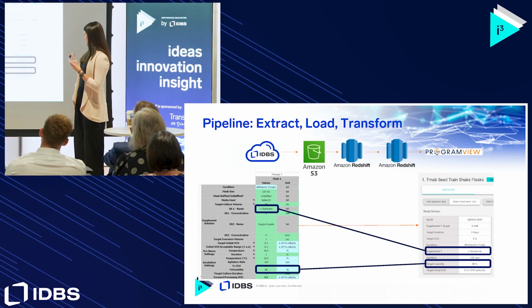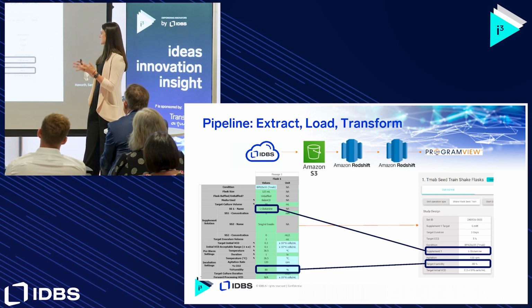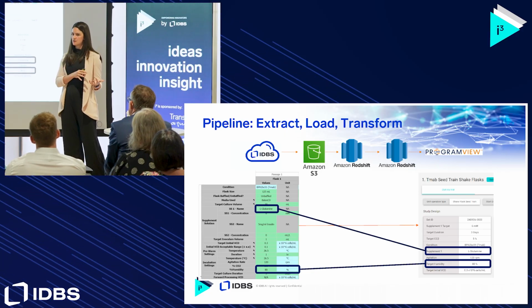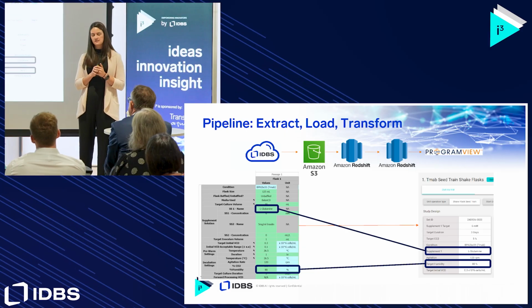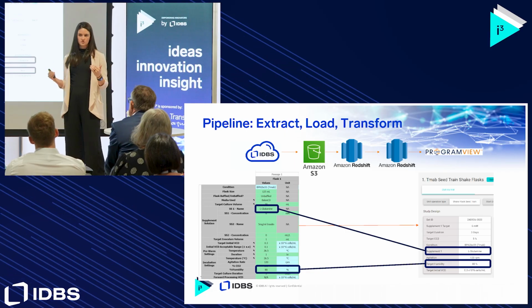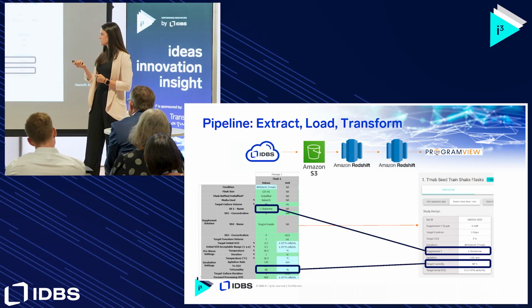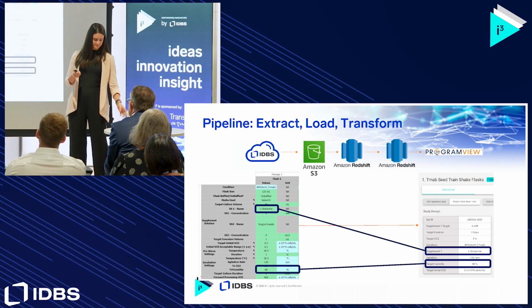So in this picture on the right, this is PROGRAMview, and the data that makes up any of these tables inside of PROGRAMview might come from multiple different tables inside of ELN. And so we're able to standardize and structure that data throughout this data pipeline so that we can decouple the views. When a user is looking at their data, it's optimized for how they need, so they can execute their experiment well and then also review their experiment and make decisions quickly.